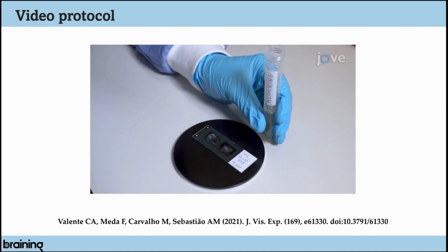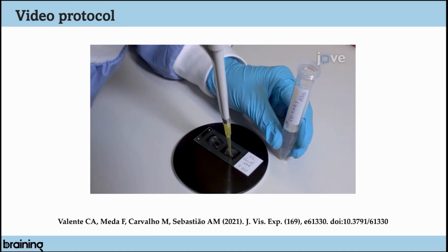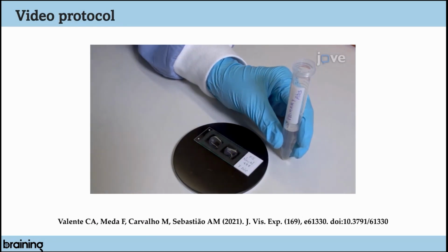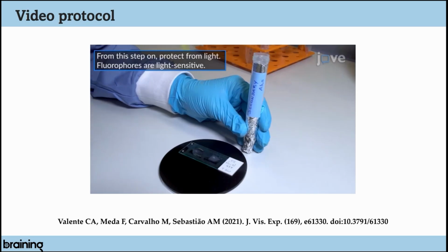Use a sharp blade to cut the slices from the inserts and place 1 slice into each rectangle. Add permeabilization blocking solution onto each slice for a 3-hour incubation at room temperature. At the end of the incubation, add the primary antibodies of interest to each slice for a 4°C incubation overnight. The next morning, wash the slices with PBS Tween 3 times for 10 minutes per wash, and incubate the slices with the appropriate secondary antibodies for 4 hours at room temperature.